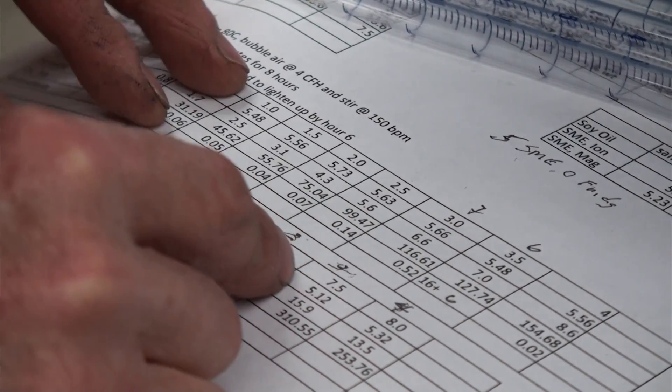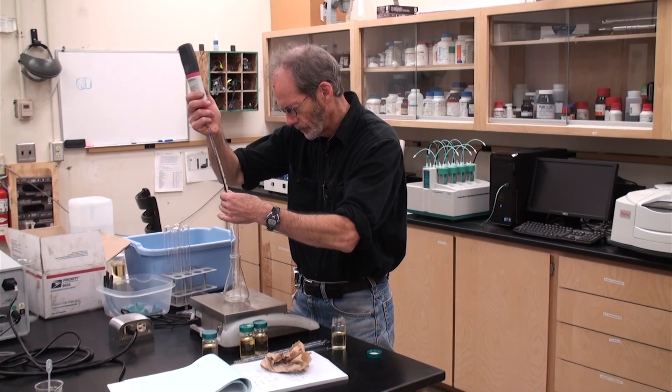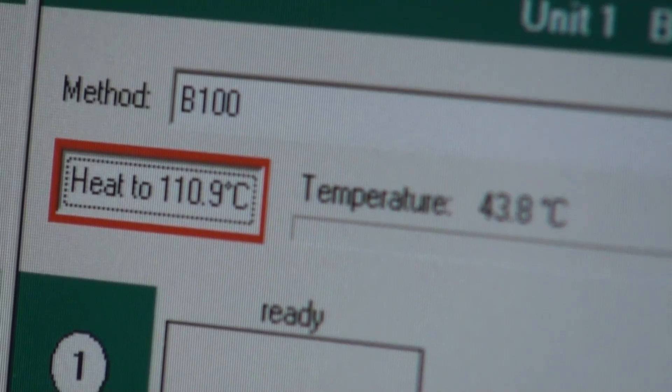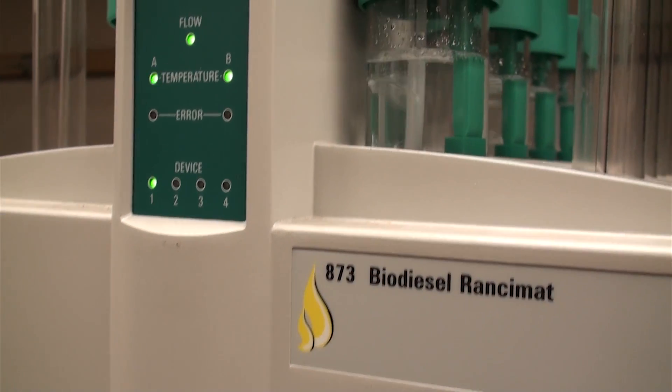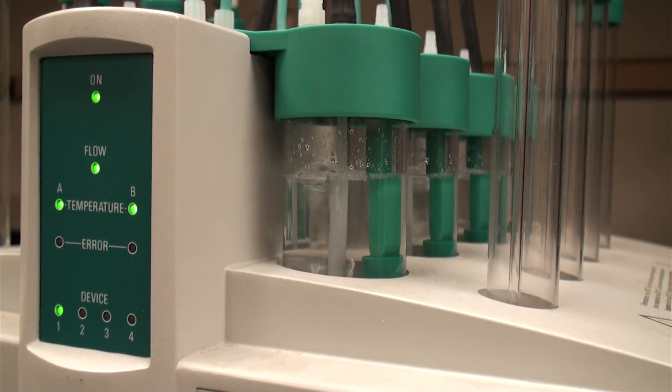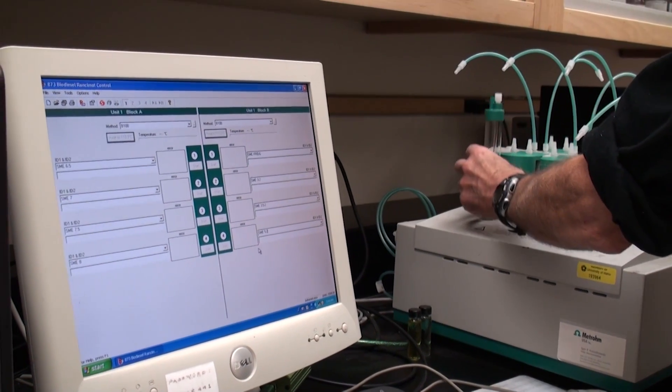We take small samples of biodiesel, about seven and a half grams, and heat it up to approximately 110 degrees C. It bubbles air through the sample, and then from there the air goes into a reaction vessel that has about 60 ml of water in it, and there's also a conductivity probe in there.